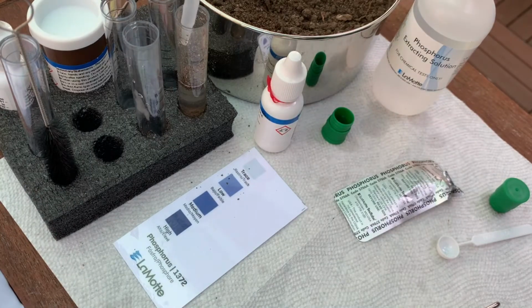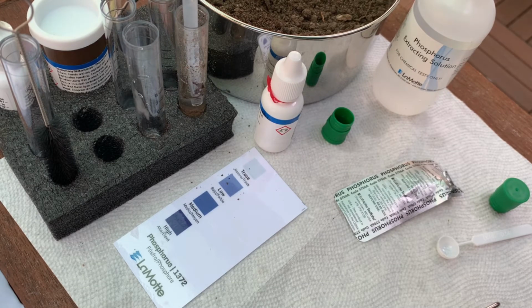And using a clean pipette, you want to transfer the clear liquid to the second clean test tube. Avoid agitating the soil. Again, squeeze that bulb before you enter the liquid. And we're filling the second test tube again to line 3. So that should be 3 full droppers.